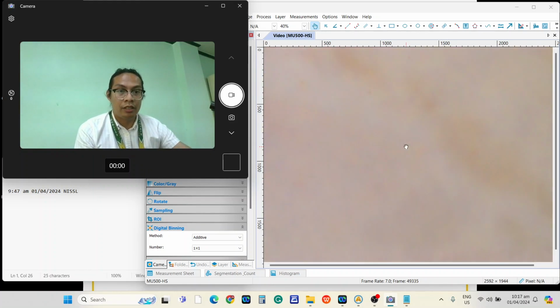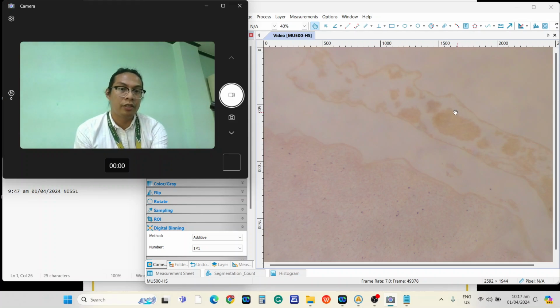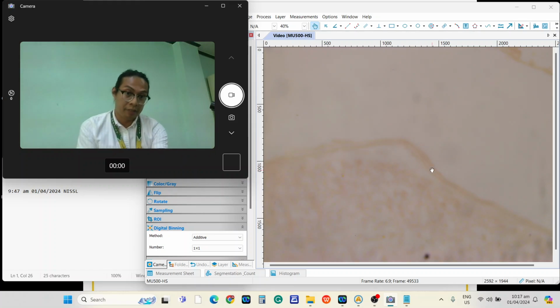Tingnan natin siya under LPO. So again, this is the arachnoid. That is the pia. Tayo under HPO. And that is the pia mater. Labo pa rin pala.